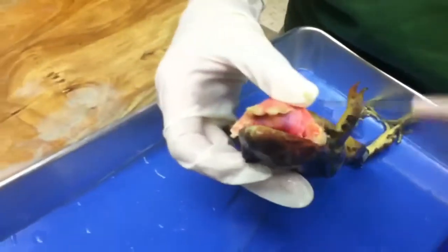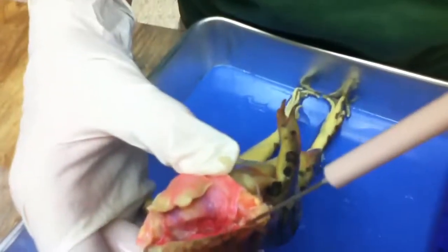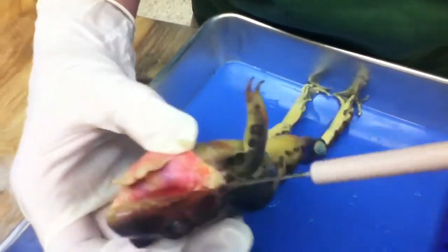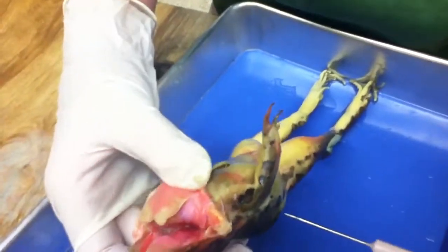The eustachian tube is right here. They're the lines around the esophagus, I guess. Oh, right there? Yeah. Alright. Goes to his ears. Oh, it does? Oh, okay. Yeah. Alright. Did your frog have eggs? Oh, okay. We don't know.